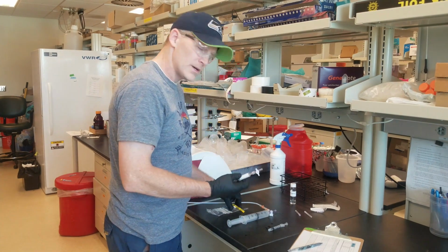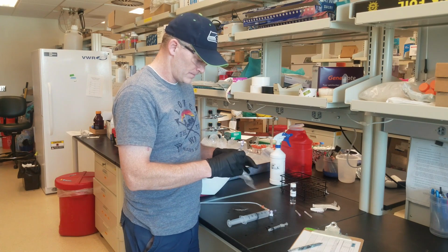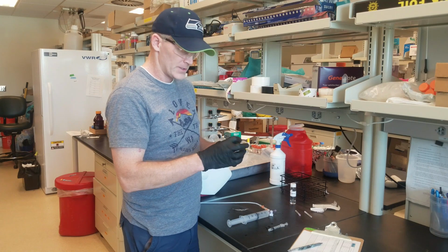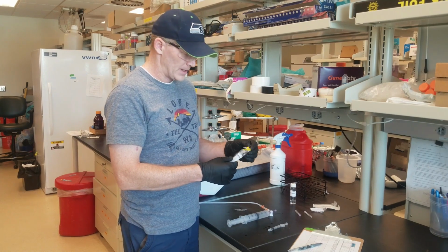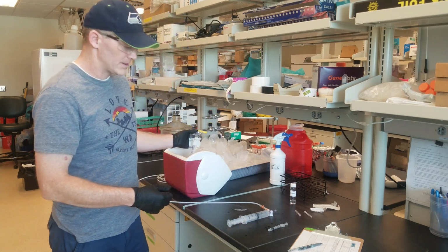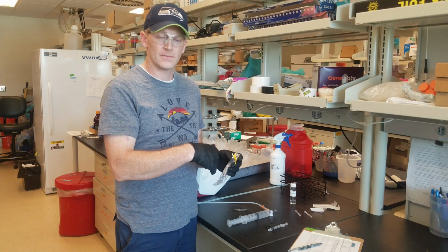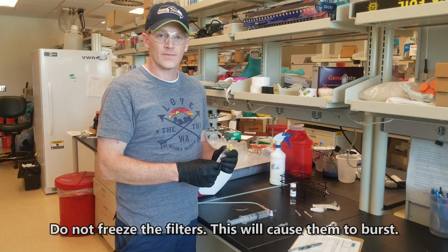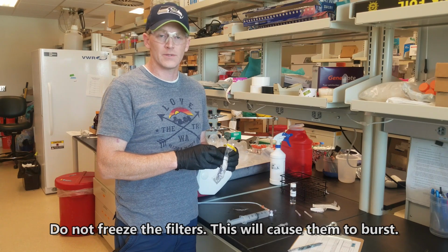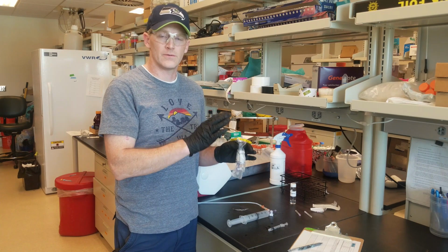Next step is to put it into Whirl-Pak. It'll fit better with just caps. The valves are a little bit long. You'll take your filter, seal up the Whirl-Pak, put it into blue ice. And you want to make sure there's no water coming into the Whirl-Pak bag. So keep it sealed. And make sure you don't freeze them with the RNAlater. That will cause them to burst. So you're just going to keep them cool. Blue ice in the field, refrigerator in the lab.